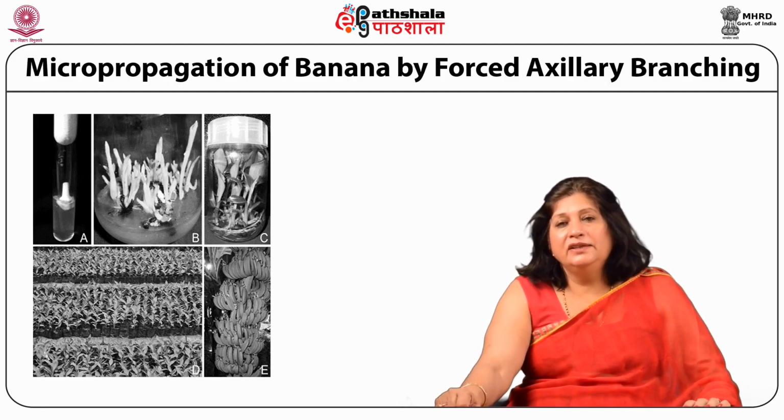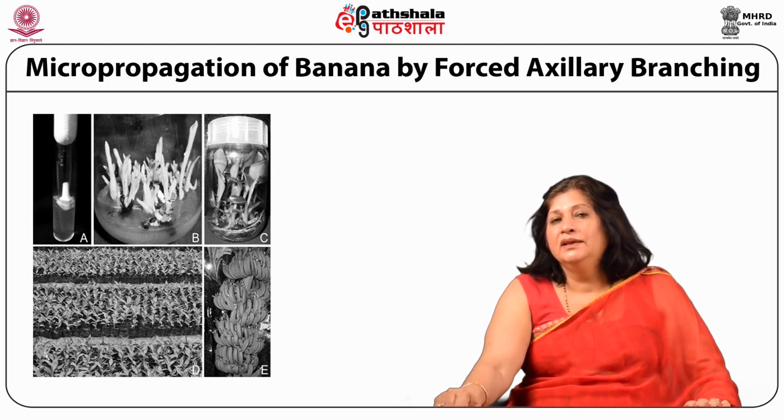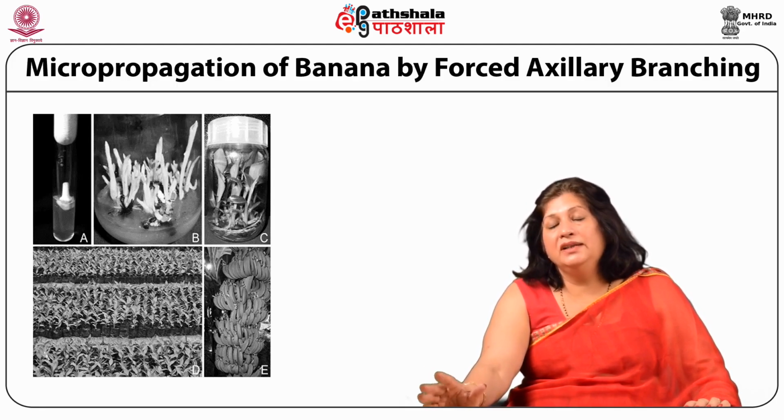And you'll be surprised that all this has been possible through tissue culture. Tissue culture in the case of banana was introduced about a decade ago, that's the time we started doing tissue culture. Of course, in other countries it was done even earlier. So the technology is through axillary branching. Once you establish cultures, they are tested for known viruses. Whatever viruses of banana are known in the country, that is what we test the explant for.